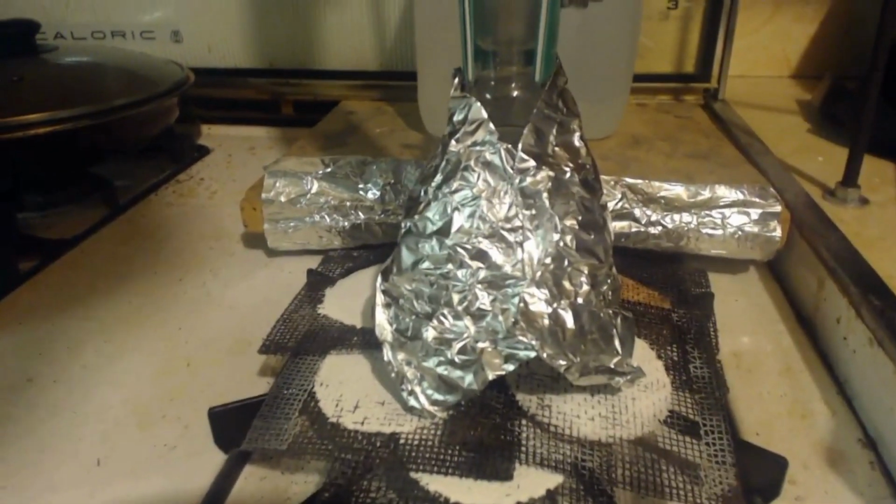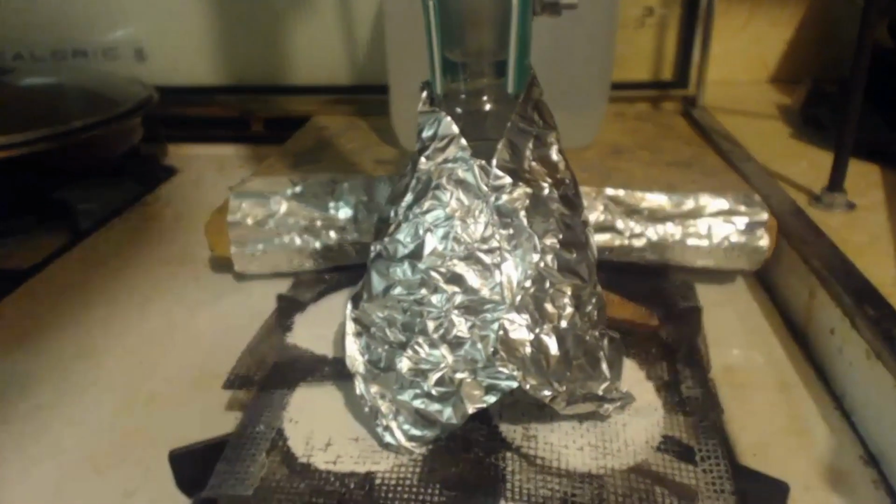So that's a little bit above dichloromethane. I'm hoping it'll jump up to at least 61. I got about a 5-second drip rate. You can see I have a lot in the receiving flask. Half of it's in the pot, say. Half of it's in the receiving flask. And we're up to 46 degrees Celsius. So something did get chlorinated. Not much though.